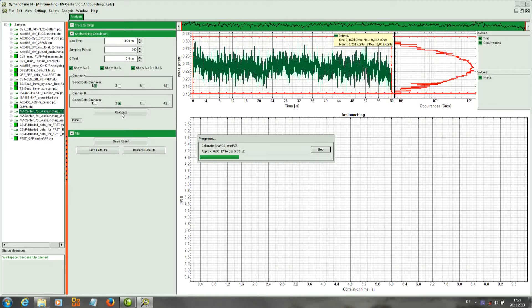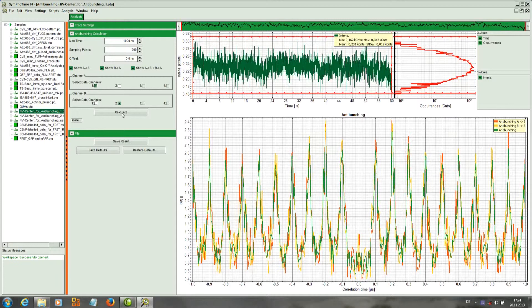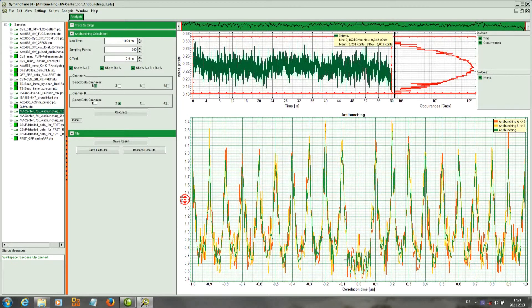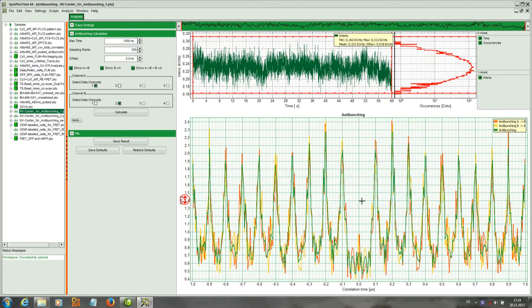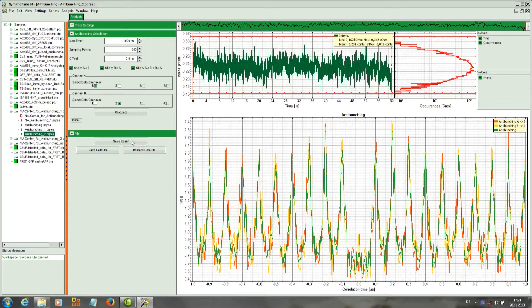So now we have a calculation going on that is a pulsed excitation. That is why the result is basically all these spikes that you can see here. And at time zero you see that the middle spike is missing which is typical for a single emitter.